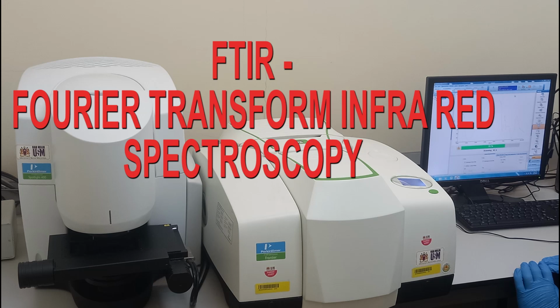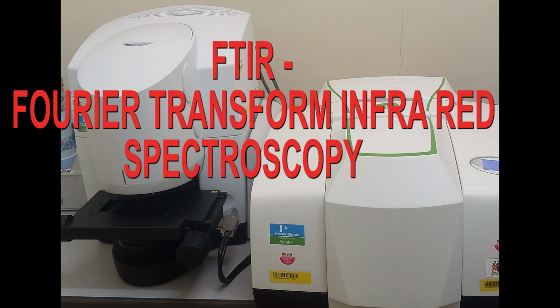FTIR, Fourier Transform Infrared Spectroscopy. It is a technique used to analyze the molecular composition of a sample based on its interaction with infrared light.